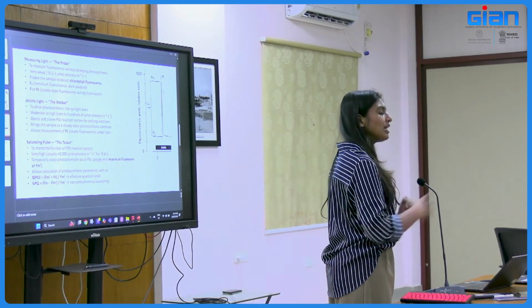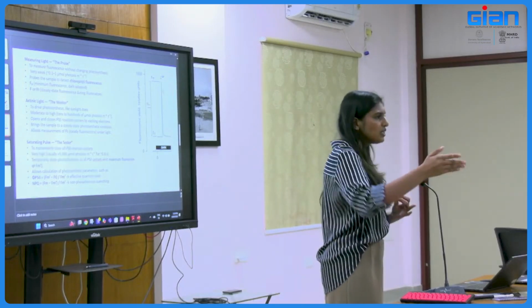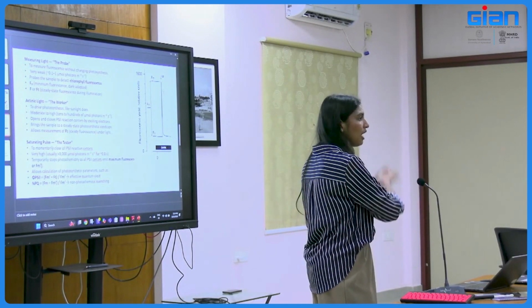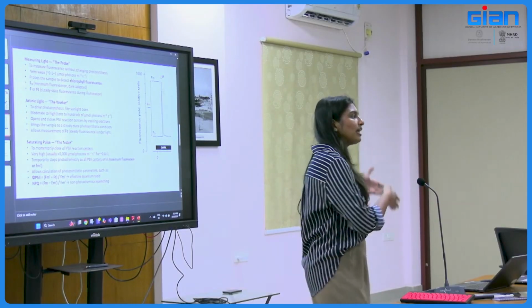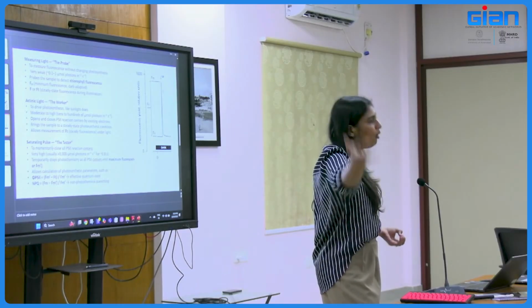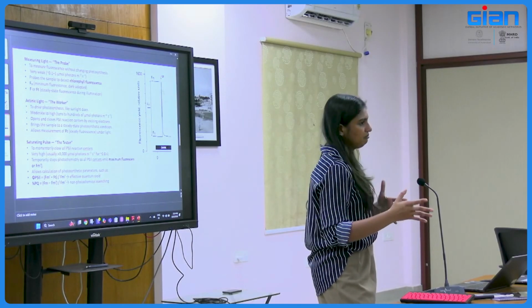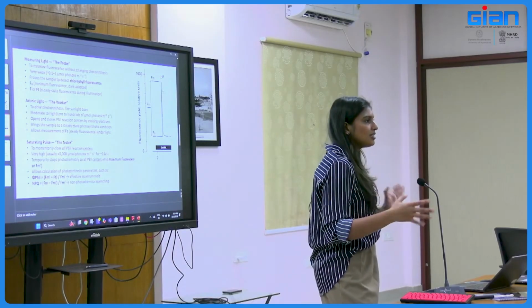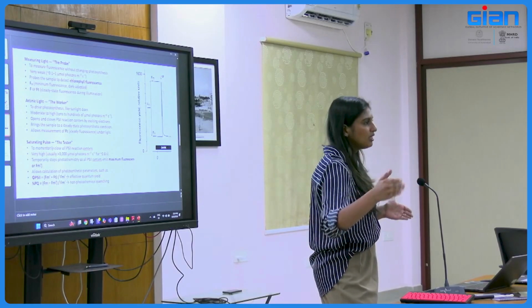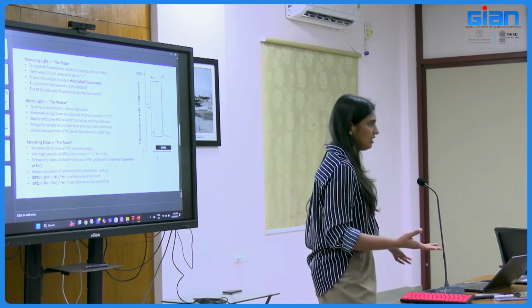But in the case of actinic light, we can call it the worker, and it drives photosynthesis. When you give an actinic light which is very intense, you can give different intensities of actinic light, starting from 12. Right now you will see down how it is working. We are giving from like 12 microeinstein, you can go up to 1000, or if you want to go more, you can go more, with an interval of time, like 20 seconds, 30 seconds. These all you can program. So giving this interval of 20 or 30 seconds, you increase the actinic light, and they will start photochemistry.